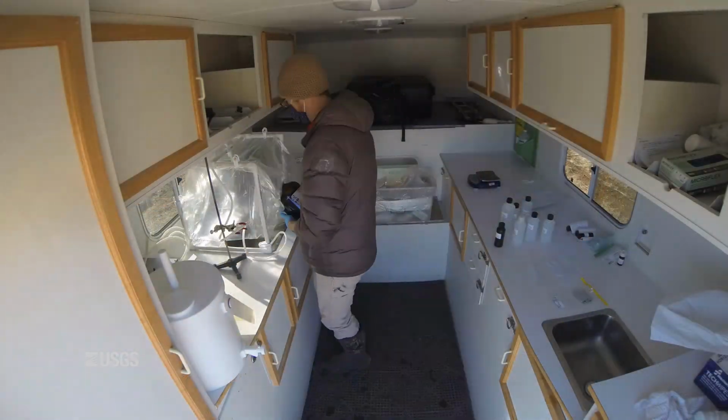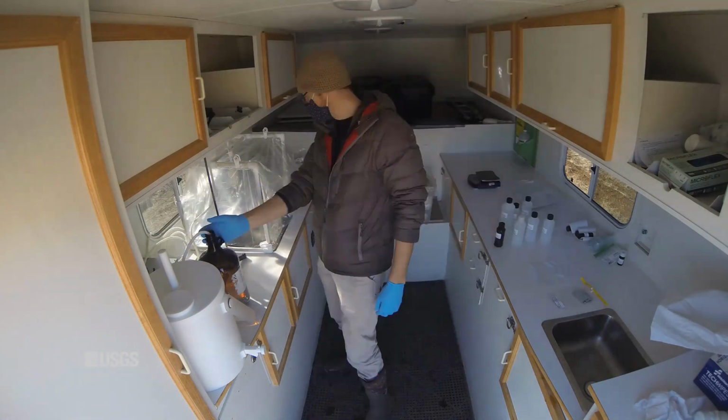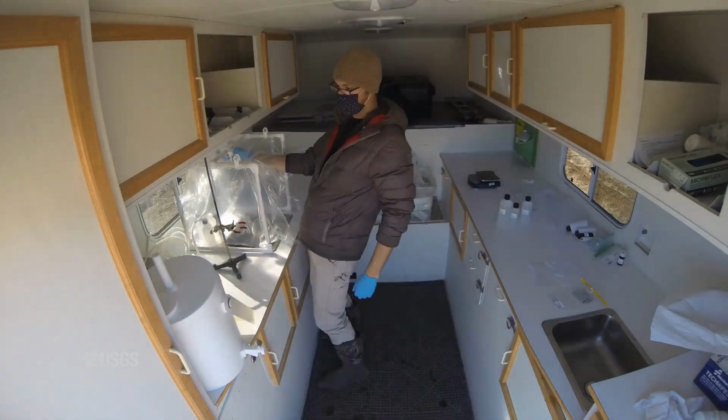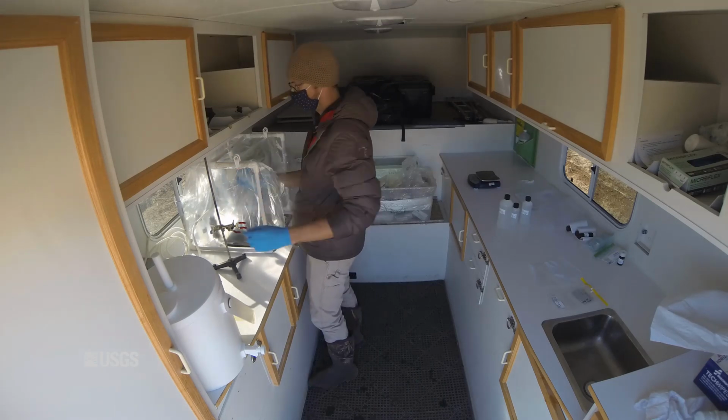I am now sampling inside the chamber bag to keep any dust and any other particulates out of the sample. I'll run some deionized water through my filter here to prime it. And now I'm collecting my sample from the water we collected in the river.